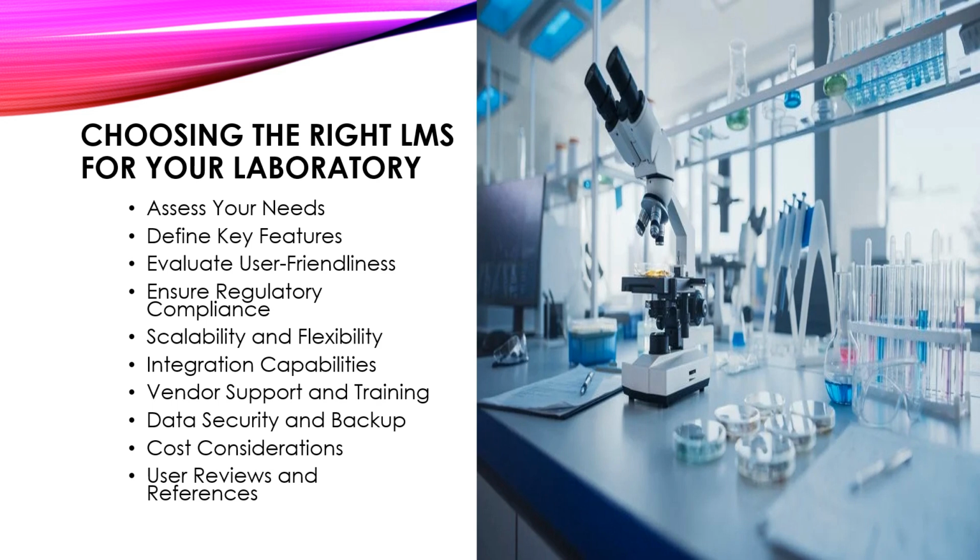It should offer features such as user authentication, data encryption, regular backups, and disaster recovery plans. Cost considerations. Compare the pricing structures of different laboratory management system vendors, including upfront costs, ongoing maintenance fees, and additional charges for customization or support services. Choose a solution that offers the best value for your budget.